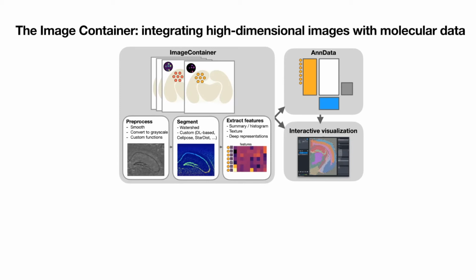In this way, what this allows you to do is extract more features, more information from the images that might not necessarily be contained in the genomics profile. And this can allow you to combine image and omics information together in nice ways, or to correlate them, or to see in how far morphology is also contained in the transcriptome and all of this.